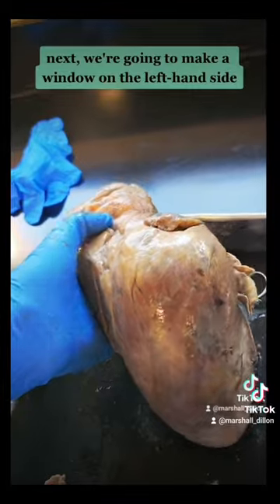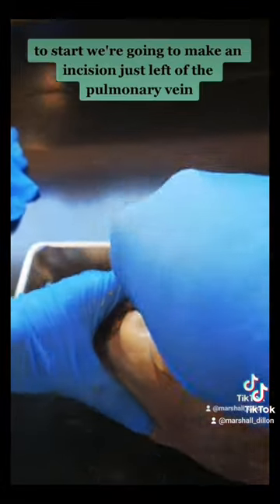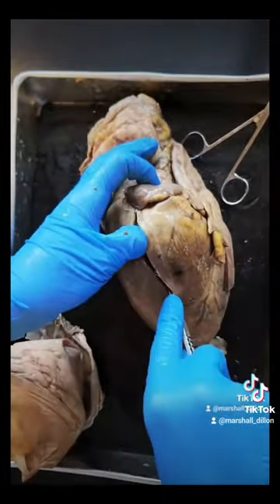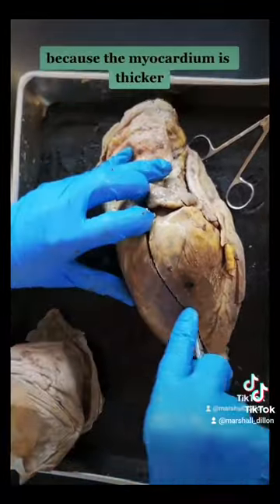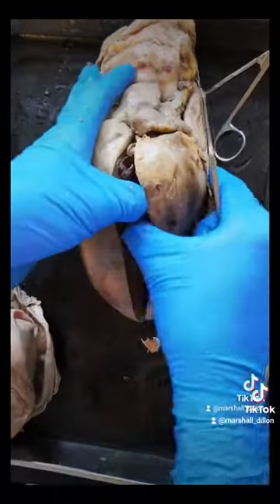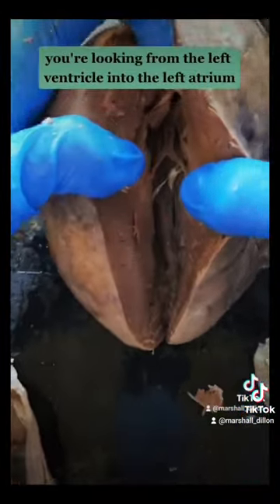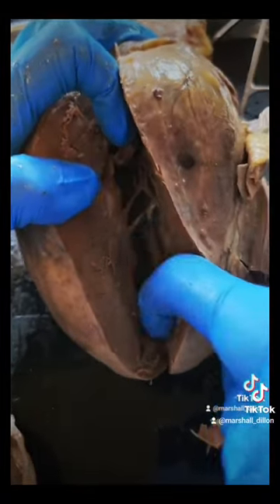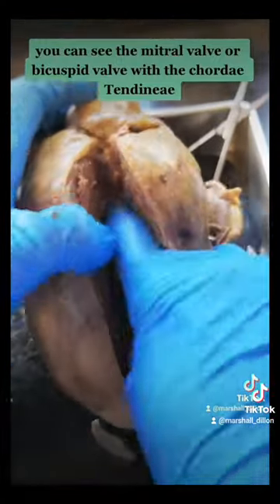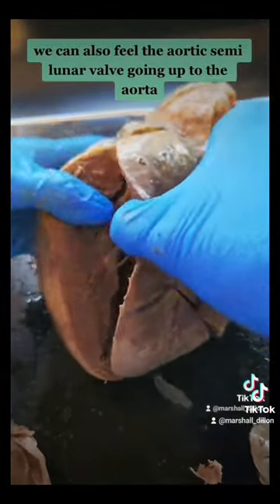Next, we're going to make a window on the left-hand side. To start, we're going to make an incision just left of the pulmonary vein, all the way down to the apex of the heart. The incisions will have to be deeper on the left-hand side because the myocardium is thicker. When you're in the left-hand side, you're looking from the left ventricle into the left atrium. You can see the mitral valve or bicuspid valve with the chordae tendinae. You can also feel the aortic semilunar valve going up to the aorta.